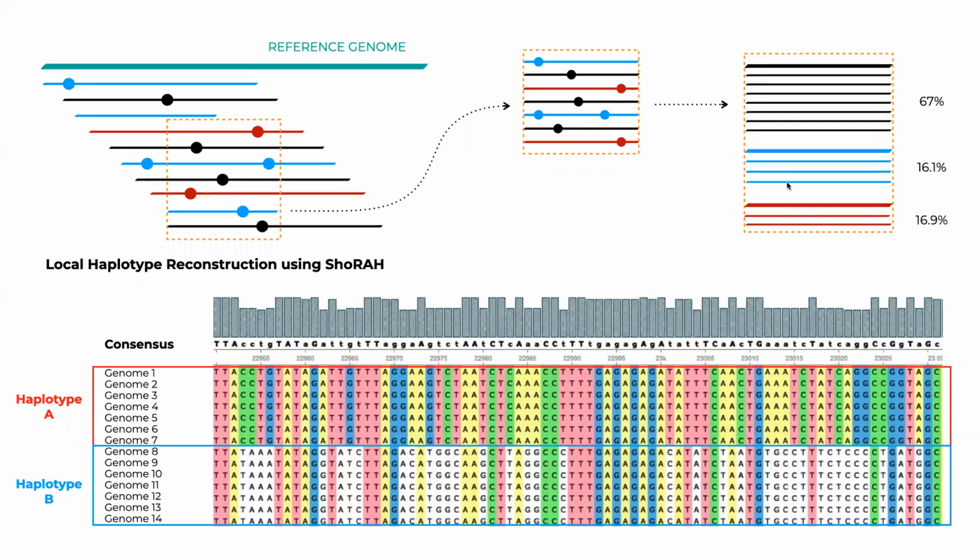And the question here, what does the blue line indicate? These are just reads, and those reads contain different types of mutations. So then we can organize them by similar mutations, mutations in the same positions or similar positions, depending on how we want to do that, and say that there are actually multiple potential genomic sequences here that could be assembled together, and we call those haplotypes. Or they're also sometimes called viral quasi-species. We'll talk a lot more about this in future sessions, but this is just for us to understand.